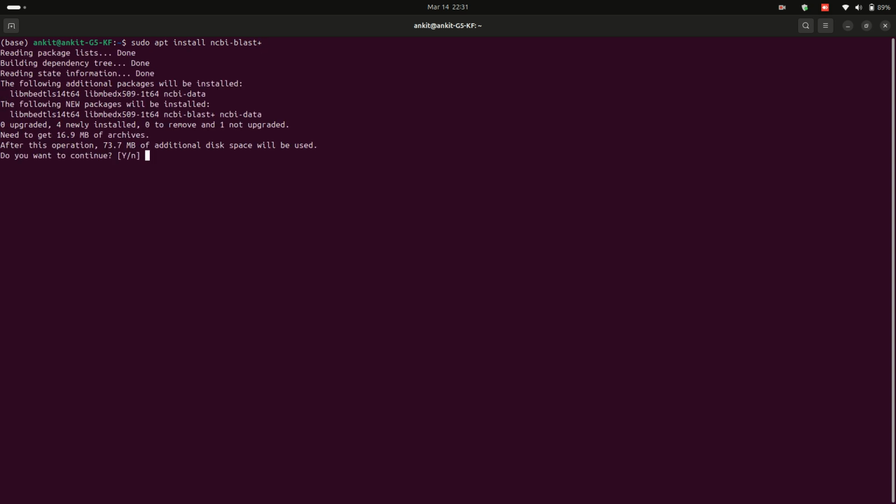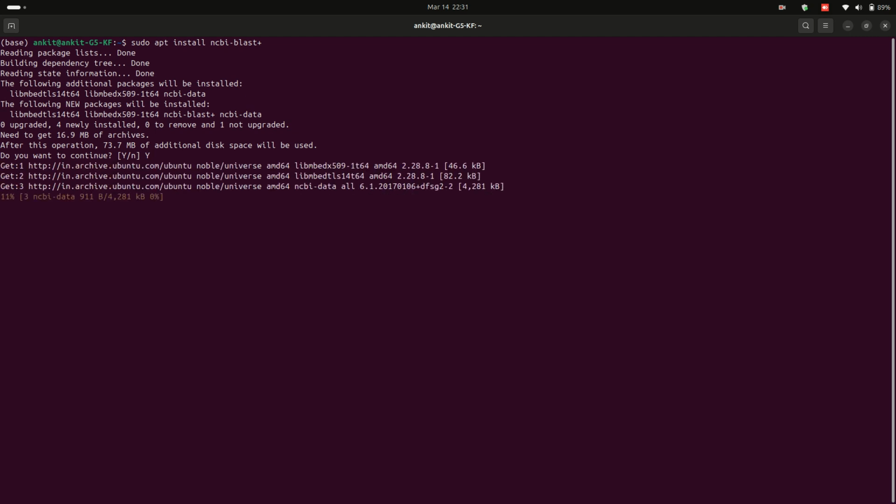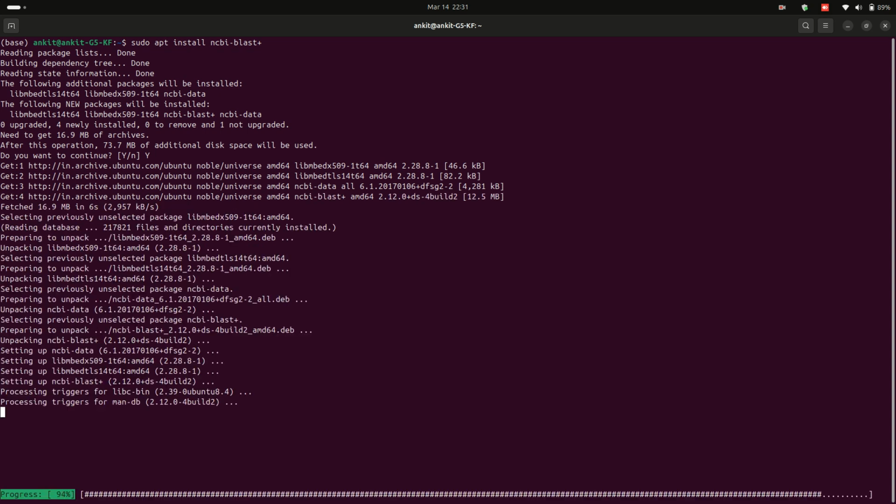Here type capital Y and press enter, and the packages are getting downloaded, so wait for some time.